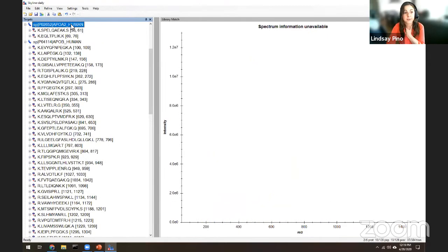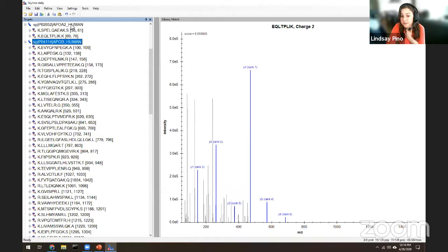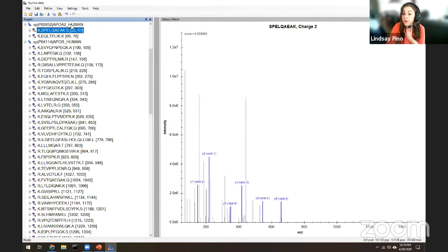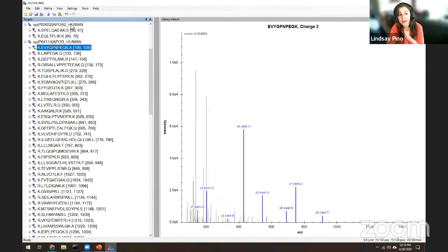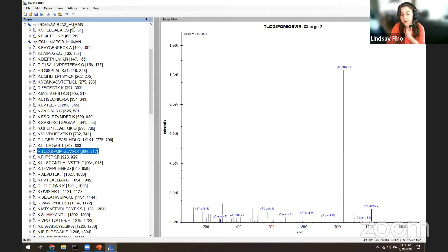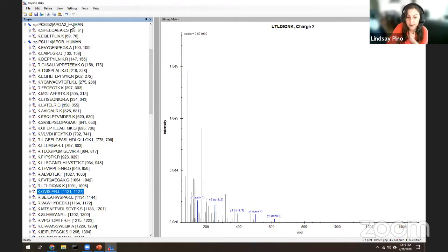And certainly some of these proteins, for example in my document, ApoA2, only had 2 observed precursors in the spectral library with the settings that we've set up. So I can't eliminate either of those two. I need to keep those. But other proteins like ApoB have a lot of potential candidate precursors, and some of them look better than others. So I can eliminate the precursors that look less good, with poorer fragmentation.